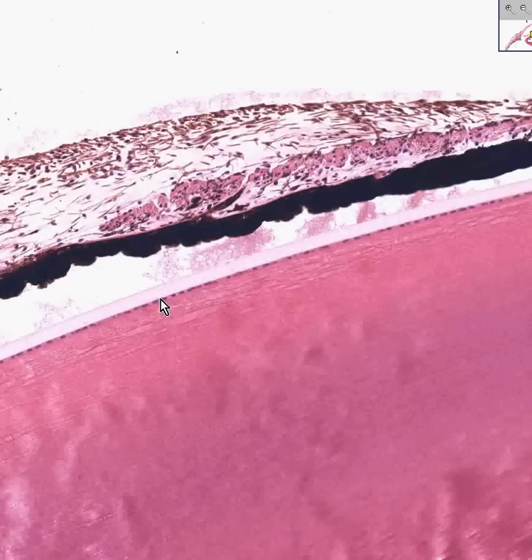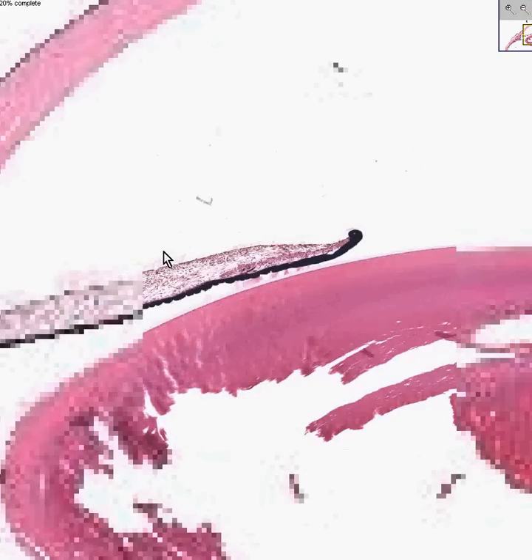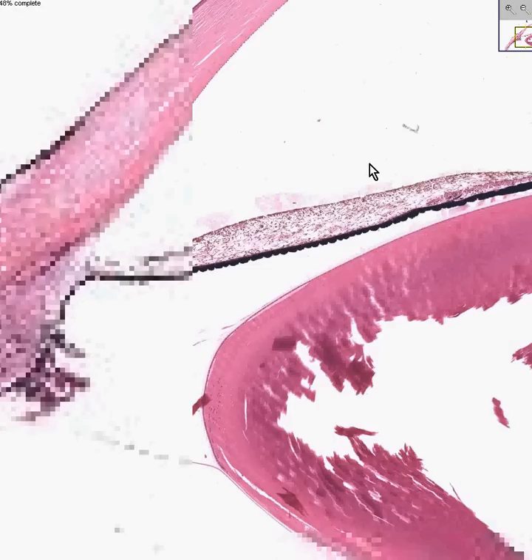Notice even the lens underneath has a little epithelium covering it as well. What else do we want to say about the eye? What else can we say about the eye? I don't think we can. It's too bad we can't see the retina.